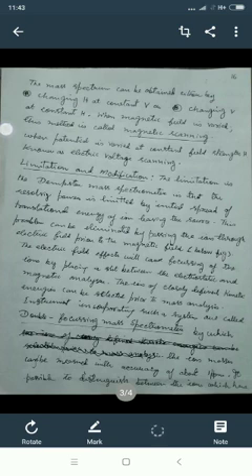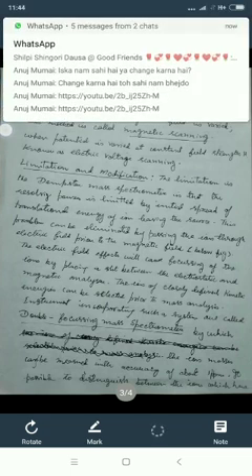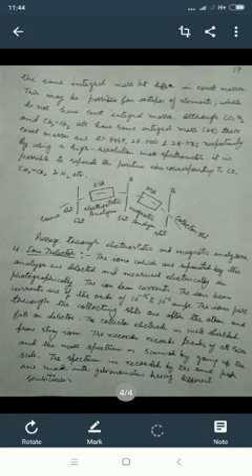The instrument incorporating such a system is called a double focusing mass spectrometer, by which the masses of ions can be measured with an accuracy of about 1 ppm. It is possible to distinguish between ions which have the same integral mass but differ in exact masses. This may be possible for the isotopes of elements which do not have exact integral masses.